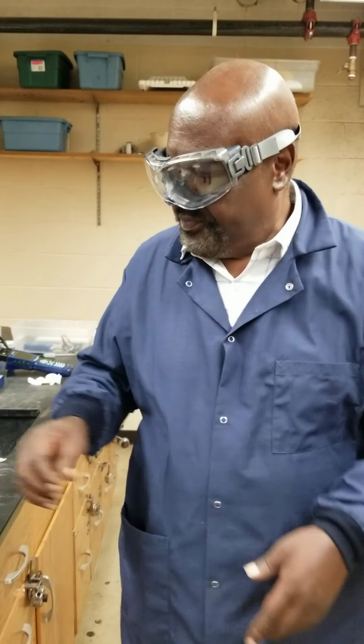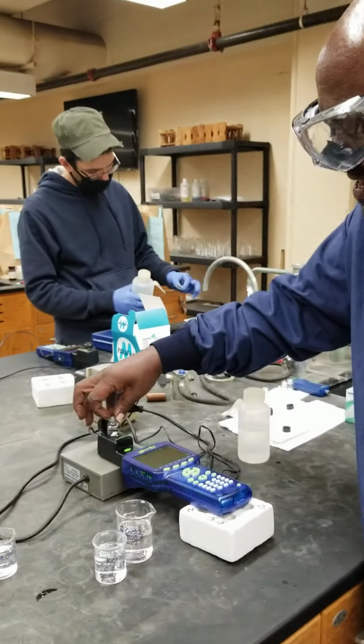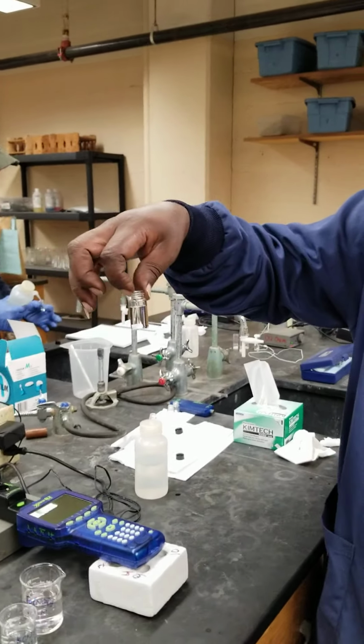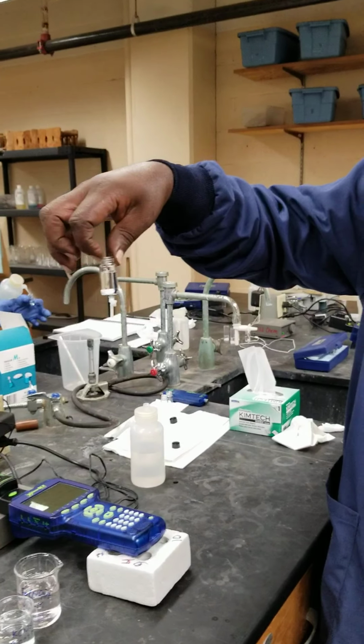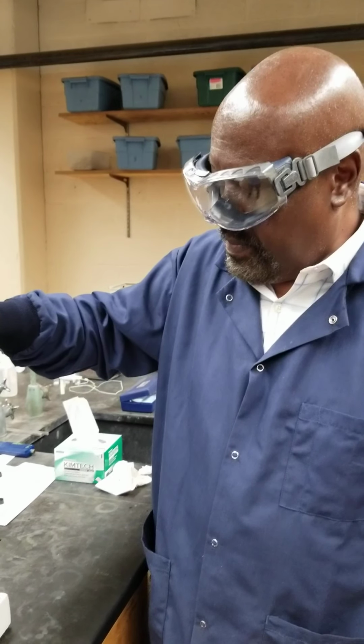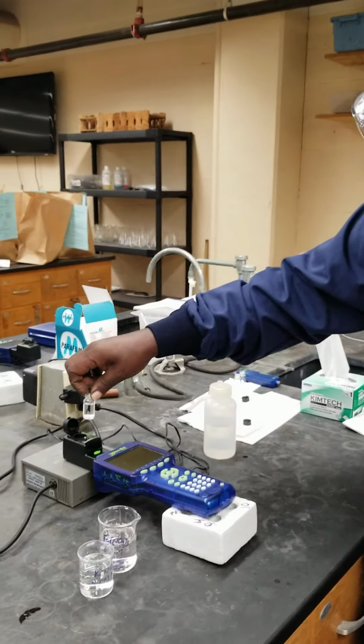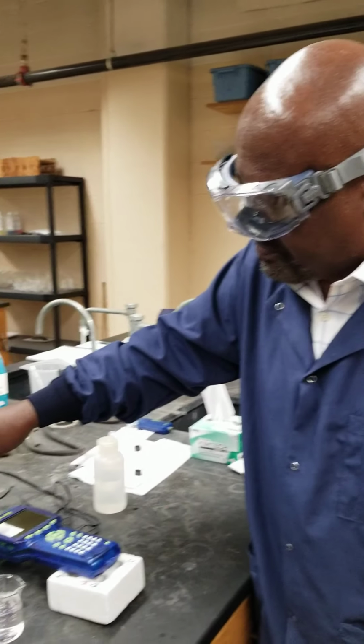So how does this go? Got something like this, my friends. That's our cuvette, one of the round ones. Put in water, which is our solvent in this particular case. You'll note that I'll put a little stir bar there.